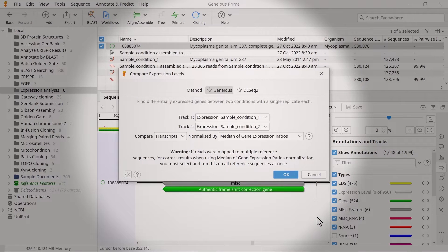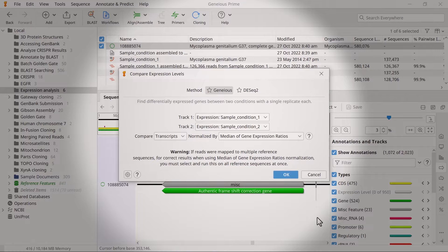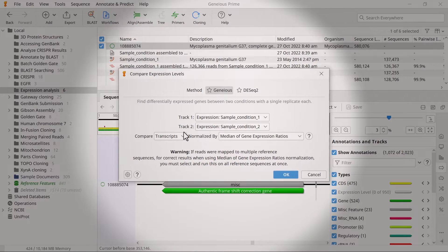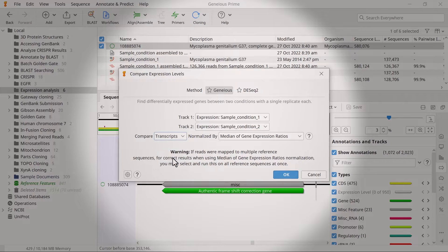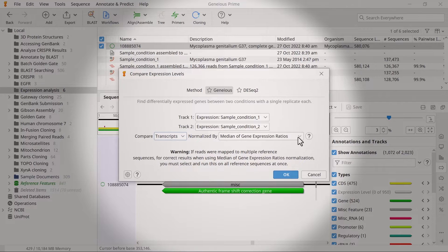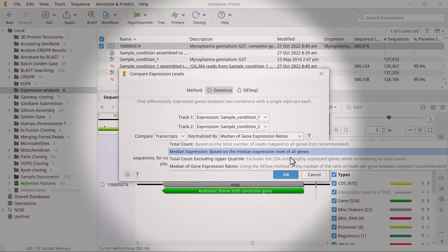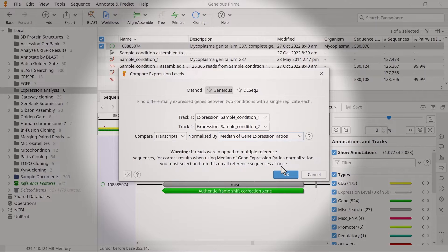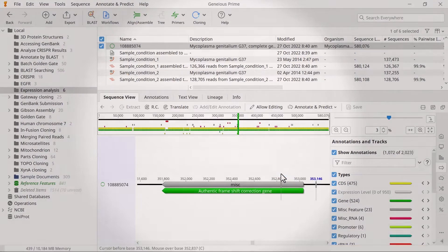In the new window, use the drop-down menus to specify the newly created tracks containing the expression level. You can then set what to compare. Transcripts, in this case, are recommended. Also, specify how to normalize the data. Usually, this is the median of gene expression ratios. Then click OK.